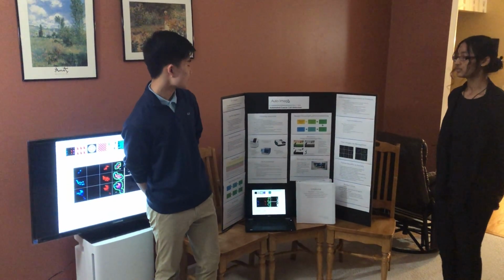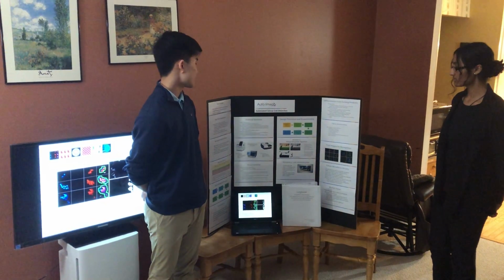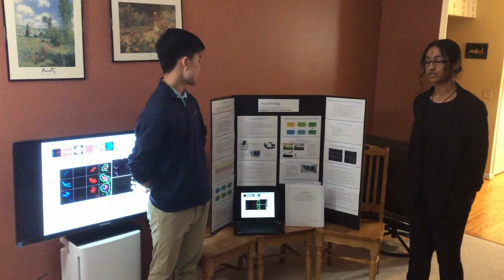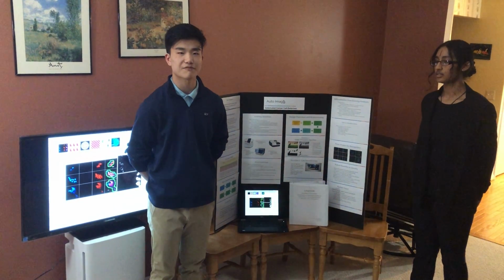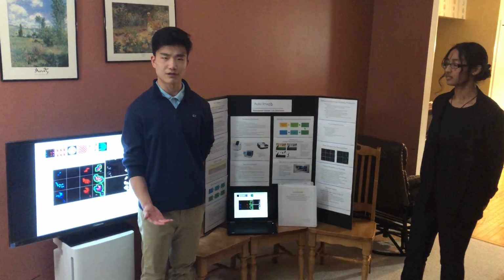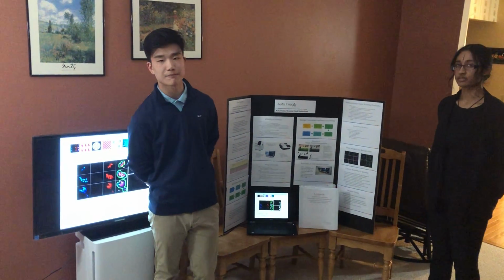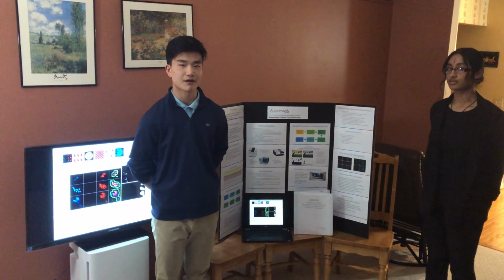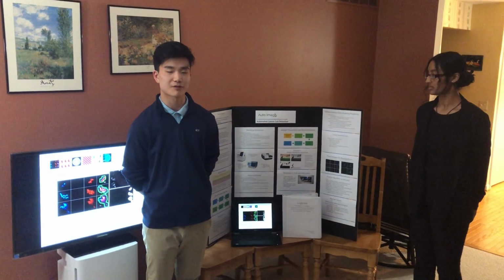Some existing solutions related to our product include ImageJ, which is a software program that allows researchers to manually count cells within it. And then there are some readers that exist today that automatically do this as well, but they can cost anywhere from about $50,000 to $3 million for a single machine, and are targeted toward large pharmaceutical companies. We also referenced some papers that included circle transforms and edge detection algorithms to identify cells, and also a cell counting algorithm that was developed within MATLAB.